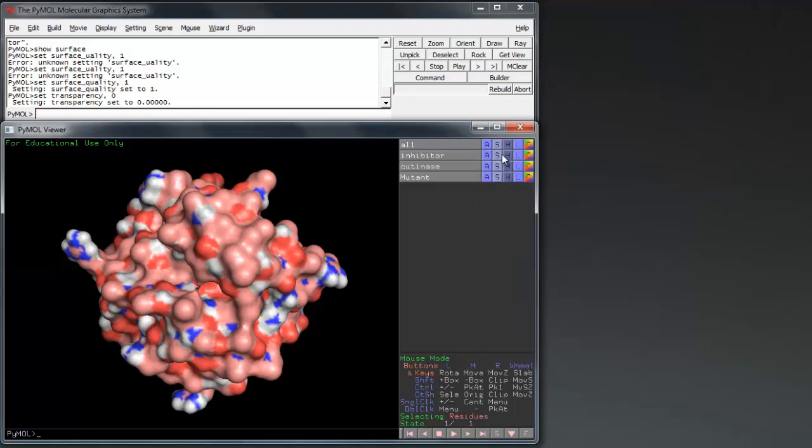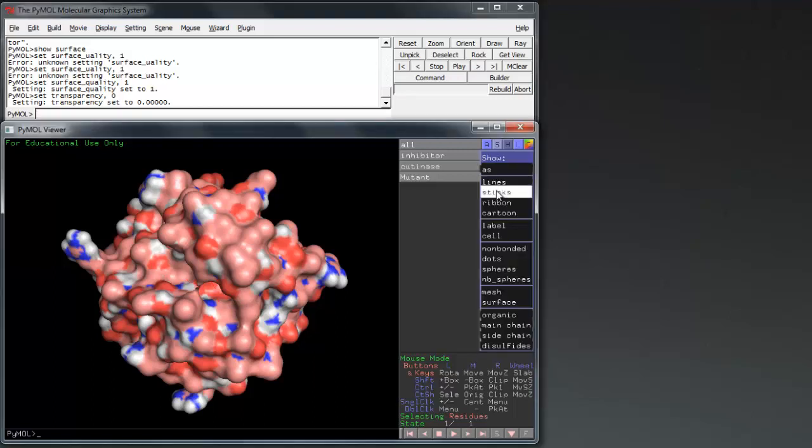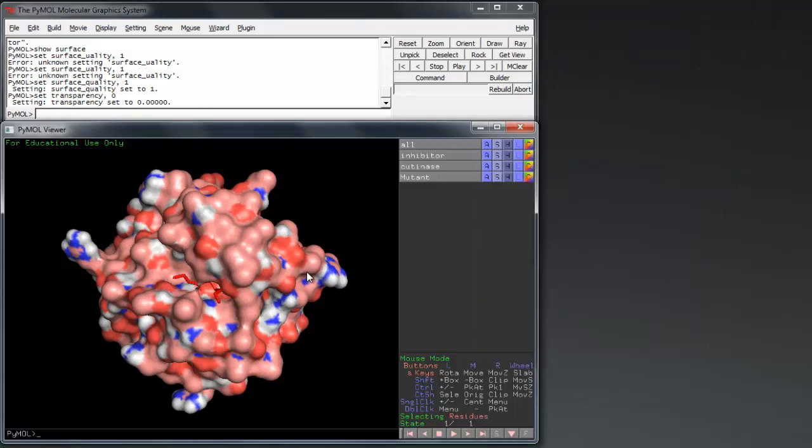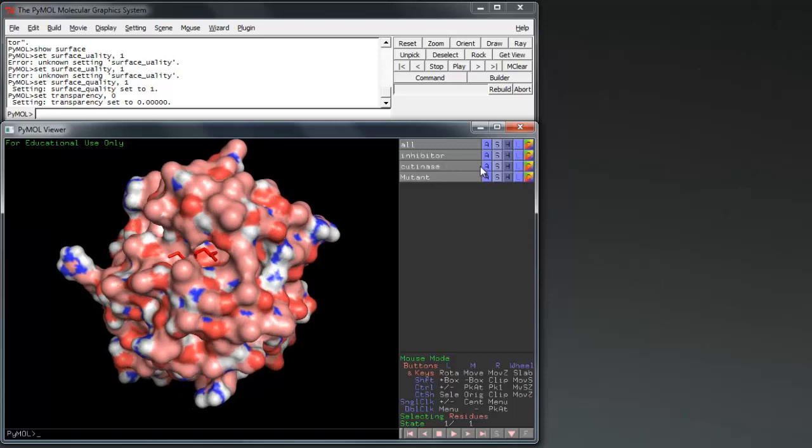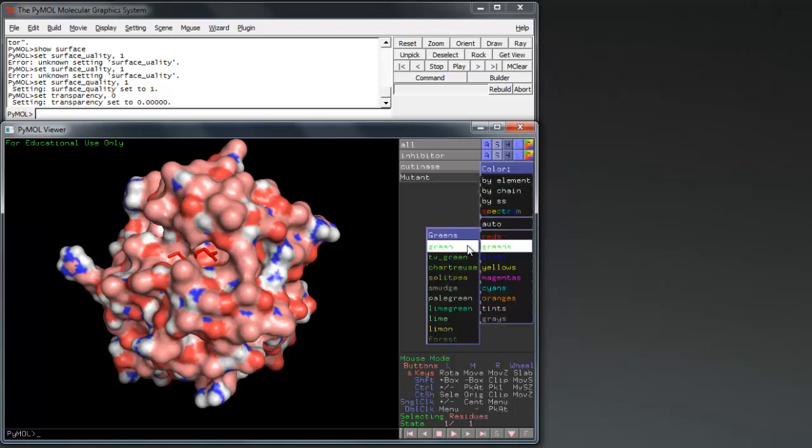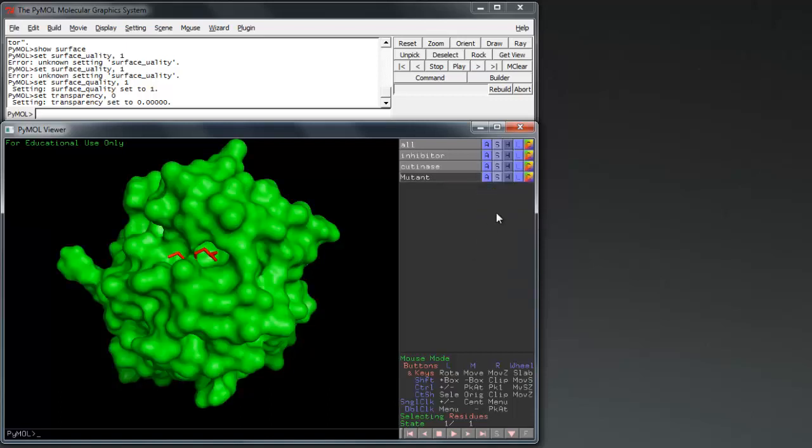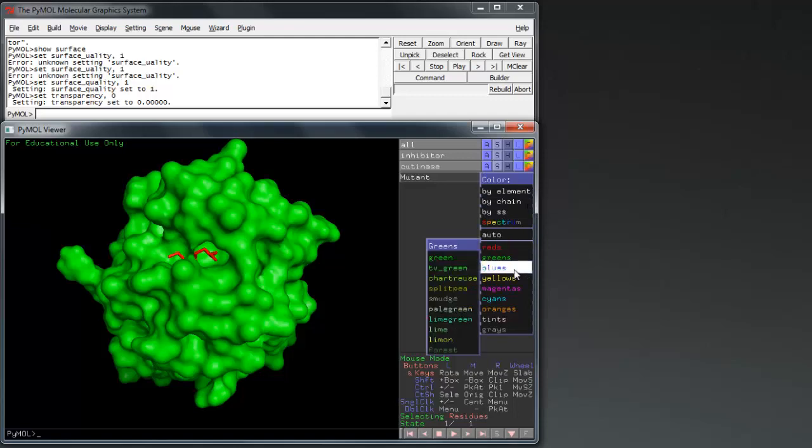By using sticks for the inhibitor instead of lines, we can more easily locate the active site. Click on either the mutant or cutanase object to hide the selected. By coloring them both in vibrant colors we can easily assess the effect of our mutation.